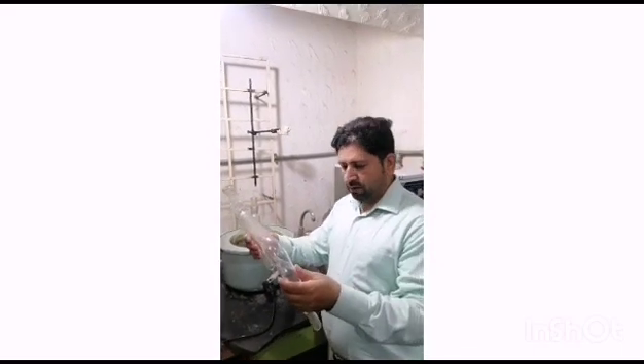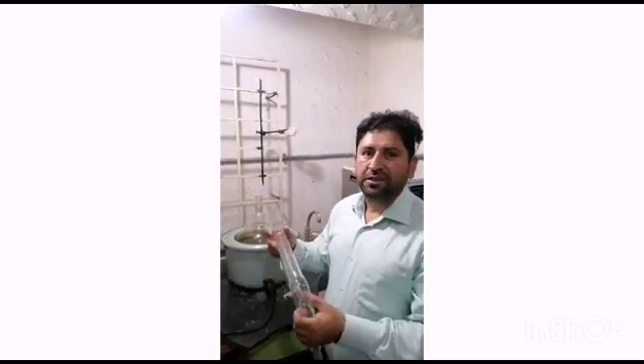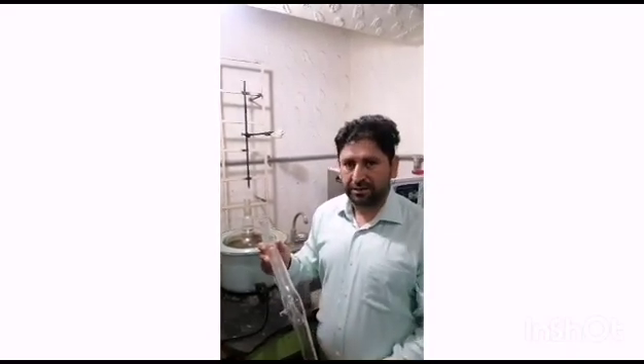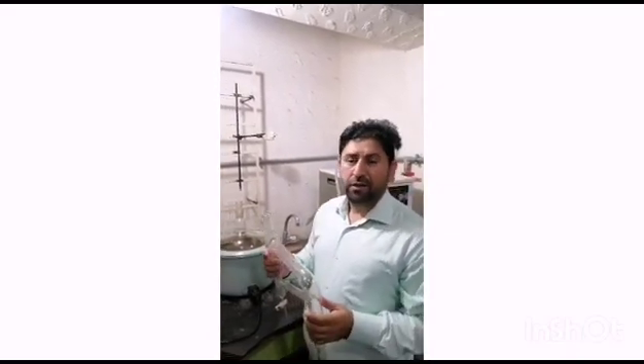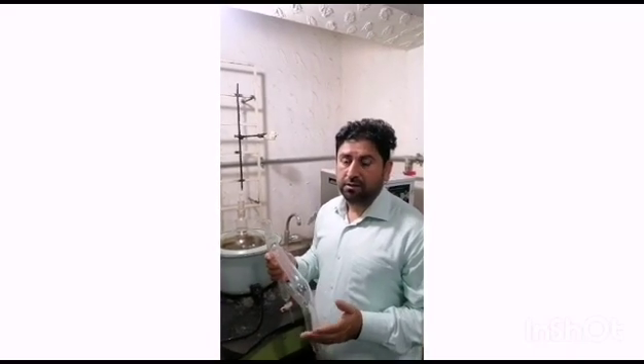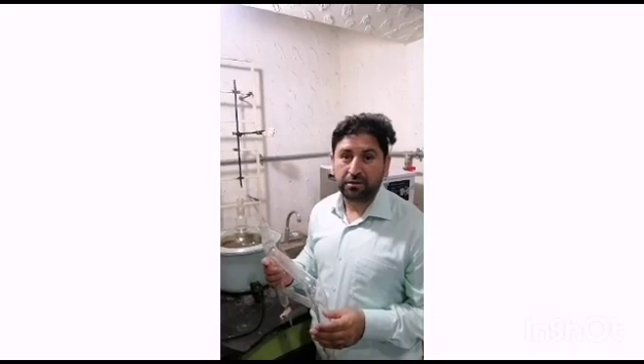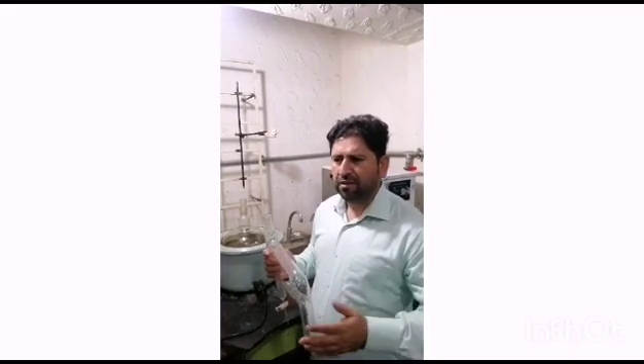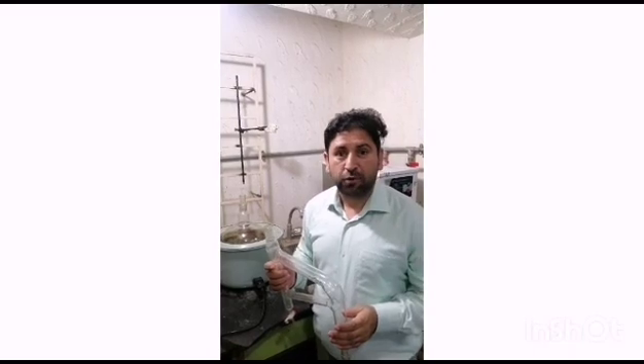So what is the use of this Clevenger Apparatus? We use this Clevenger Apparatus to extract oil from different plants. There are many uses of these oils — like people use these essential oils to relieve pain, to relieve stress, to form muscle relaxants and antibacterials, and many other uses you can find from Google.